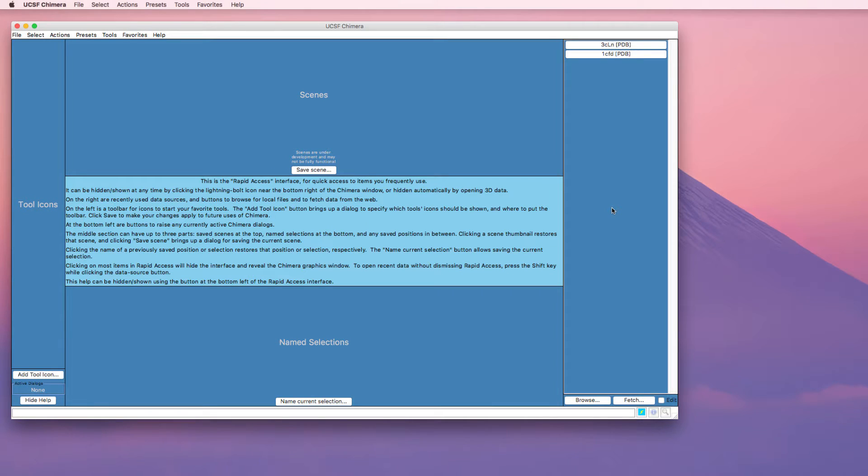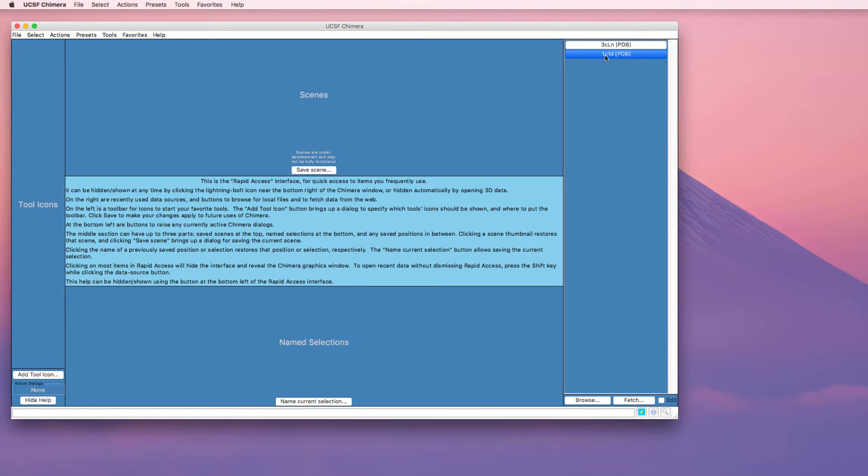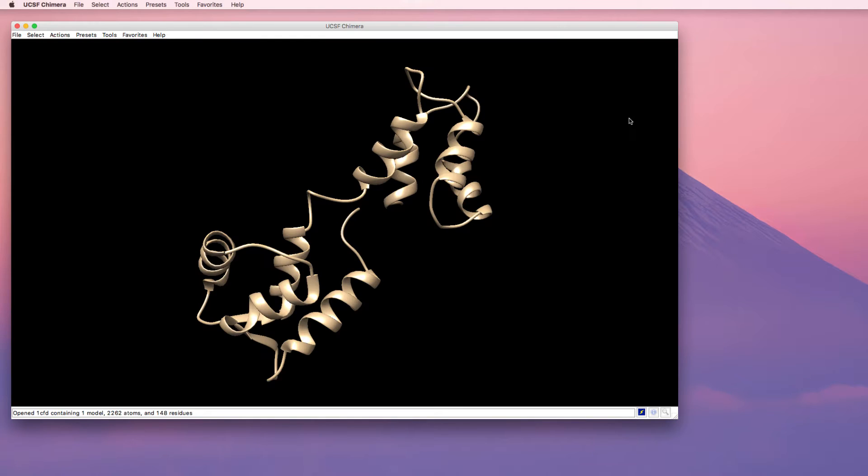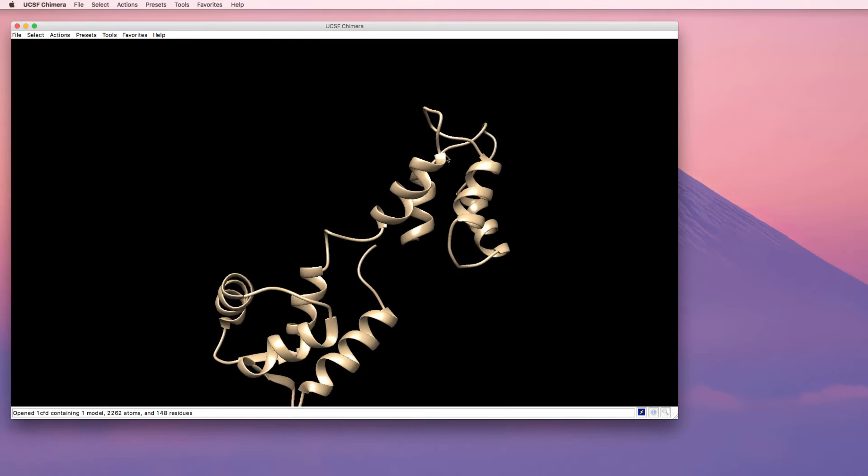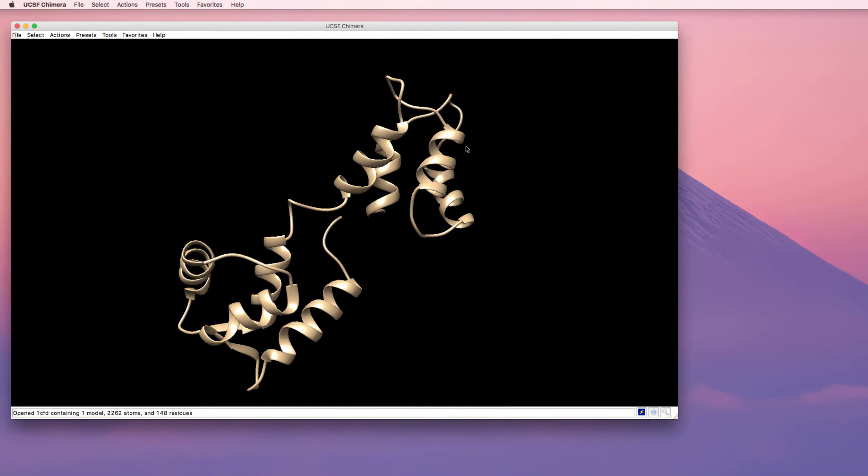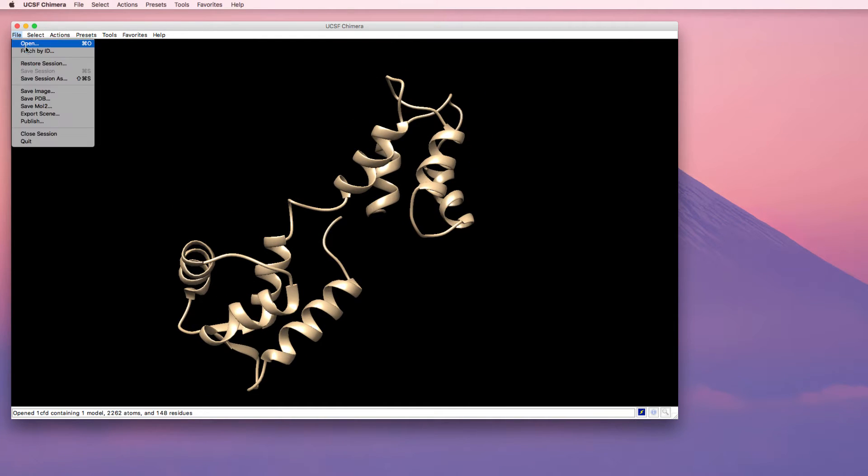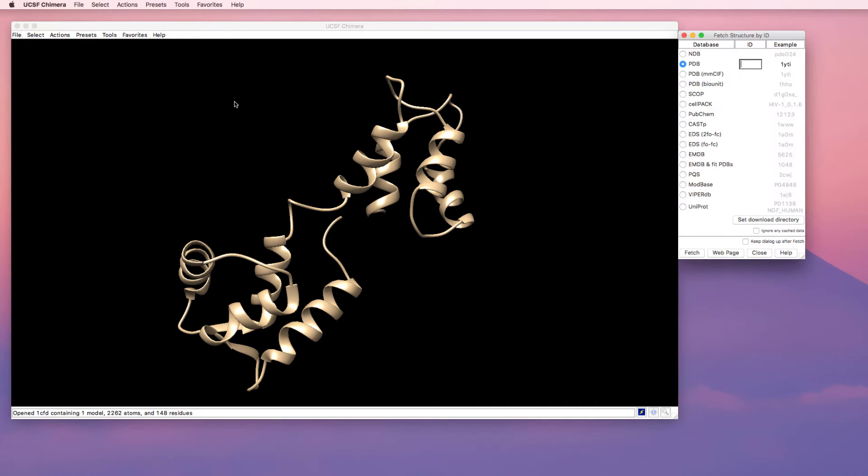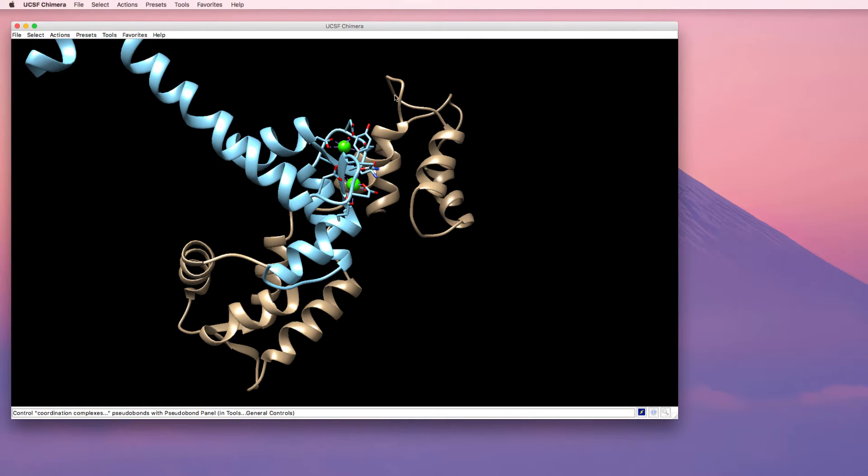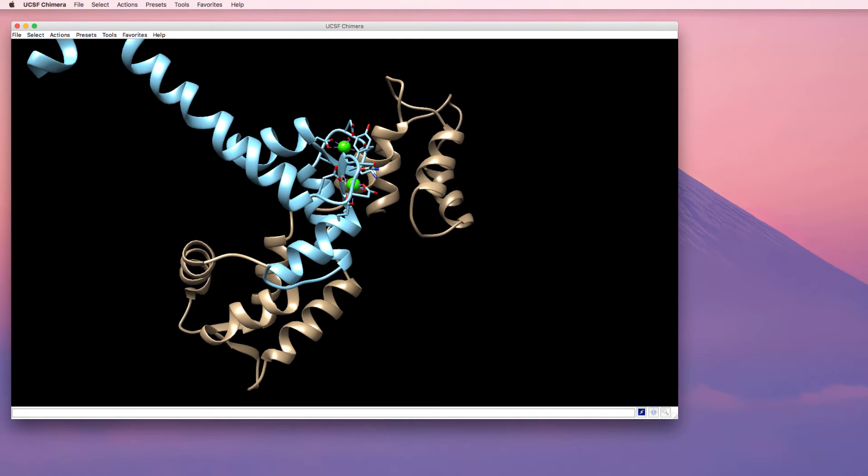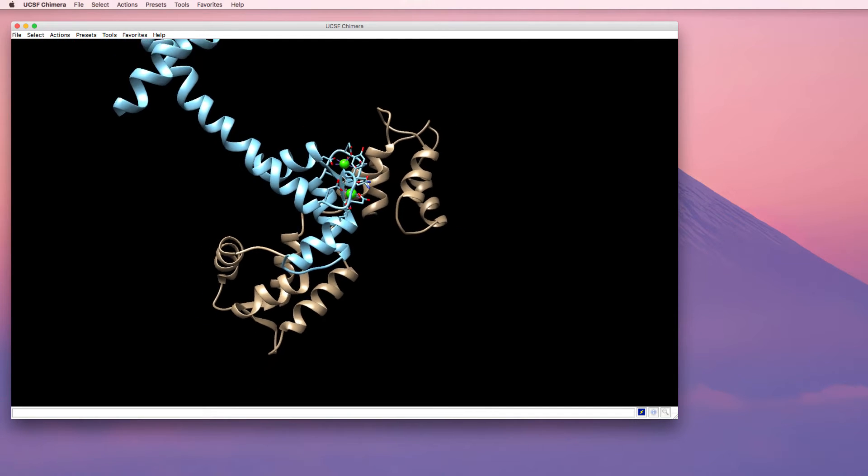I'm going to use the metal binding protein Calmodulin as an example. I've got the two PDB structures here. So I'm going to open the APO form of Calmodulin and also open the halo form. The easiest way to do this is just to fetch it by its ID. So now we have both the APO form and the calcium bound form of Calmodulin open in the window.